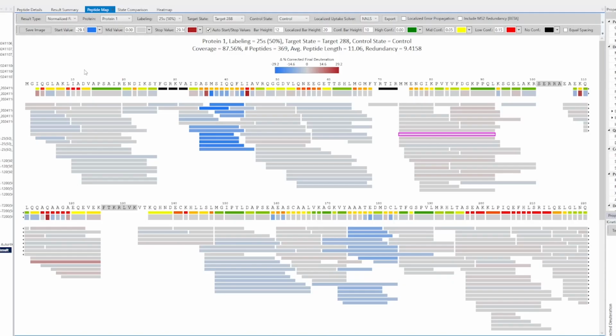They'll get converging values for most of the peptide segments, for most of the protein segments. So how does it actually calculate the deuterium incorporation on each segment here? Well, just like in the original HD examiner, the first thing it'll do is draw peptide boundaries for each peptide. We usually ignore the first two residues of the peptide just because the back exchange in that zone is really fast, so it doesn't really hold on to deuteration really well. This setting will be covered in the parameters a bit later, but you can override it so that you only omit the first residue, for example.